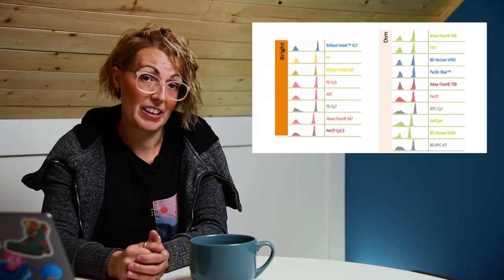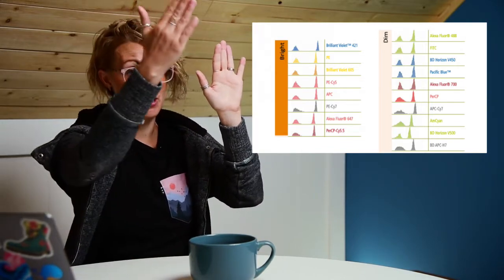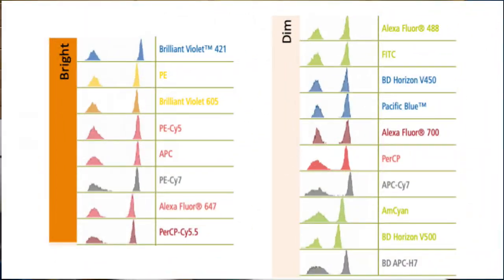So when you're dealing with fewer than 6 fluorochromes, there are more than 6 bright fluorochromes on the market. So you might as well select the best fluorochromes possible and not use the ones that have a lower resolution capacity. The graph to the side here will give you some idea of how stain index looks. You can see that as we change fluorochromes, our gap between the positive and negative is becoming smaller and smaller. The brightest fluorochromes that have the greatest separation are going to be things like BV421 or PE. Down at the bottom of the list, you'll see the fluorochromes that have worse resolution.